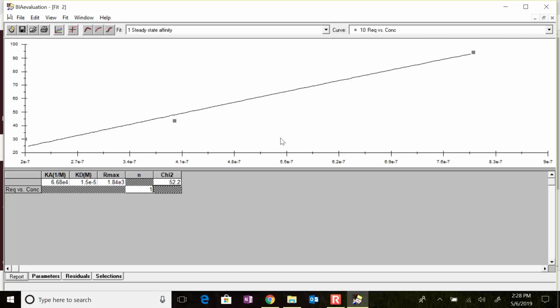This probably is not the best fit, so I'm going to want to go back. I'm going to take this data and see if I can get a better fit or if I can fit in those other ones. Just getting 1 or 2 more data points down at the very bottom is usually a huge help to this. But the other thing to realize is that the 0 should be part of this graph, and it's not. So when you're looking at it and evaluating it, be sure that you think about things that way.